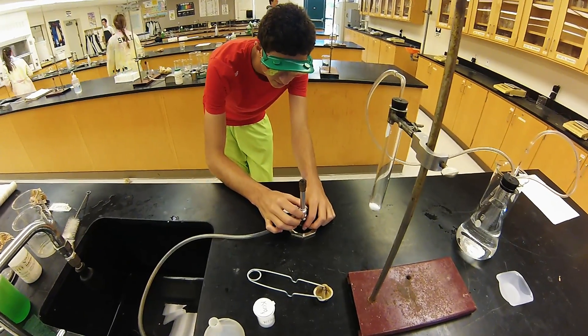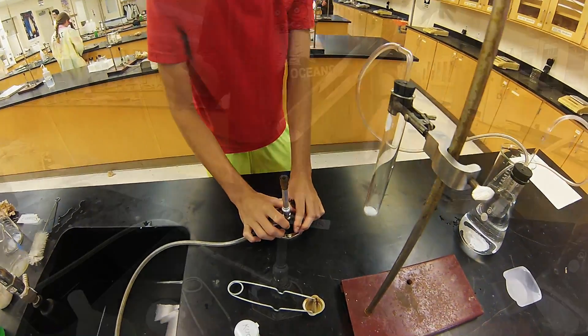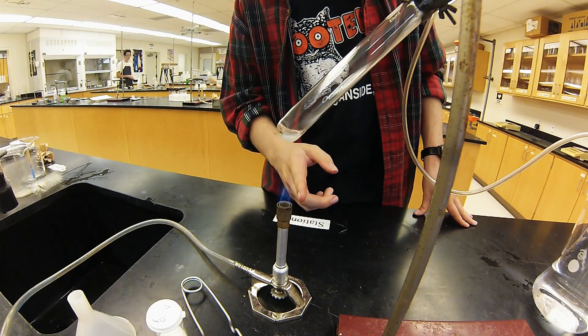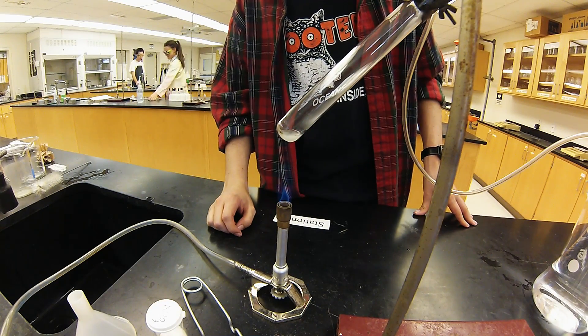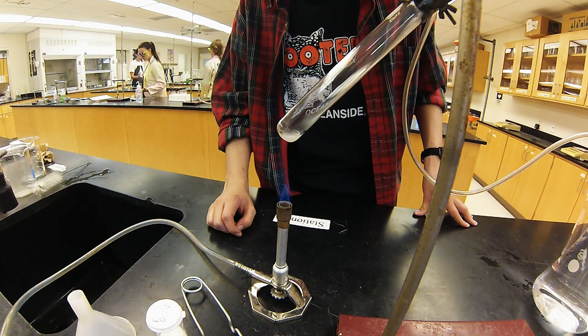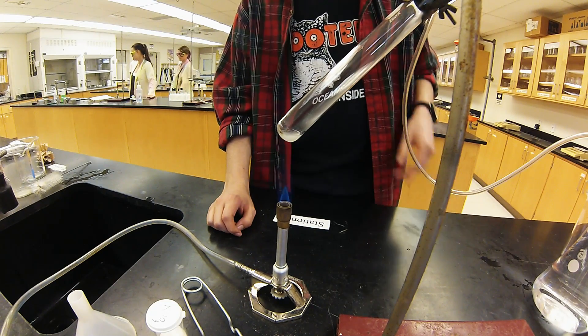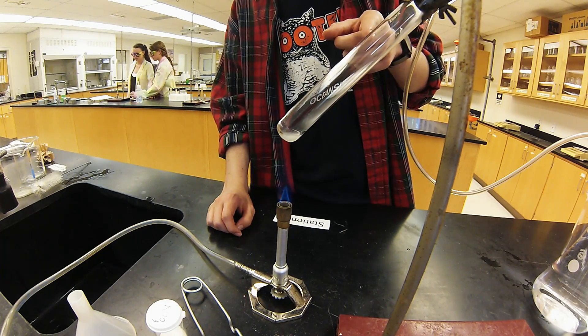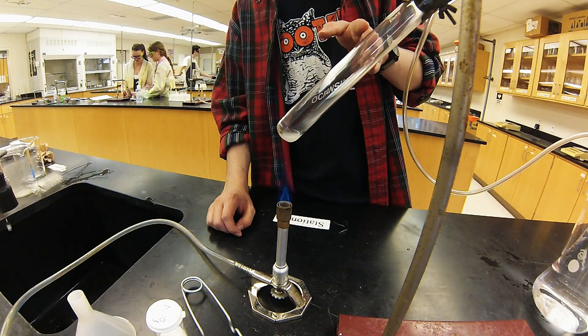Look at that flame. As the potassium chlorate is being heated, it's producing oxygen gas and that's building the pressure in this large test tube we have and pushing gas out into our Erlenmeyer flask.